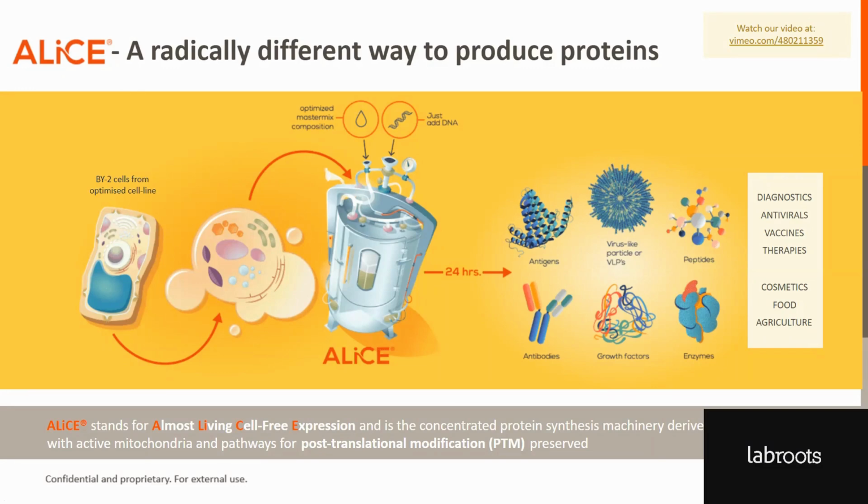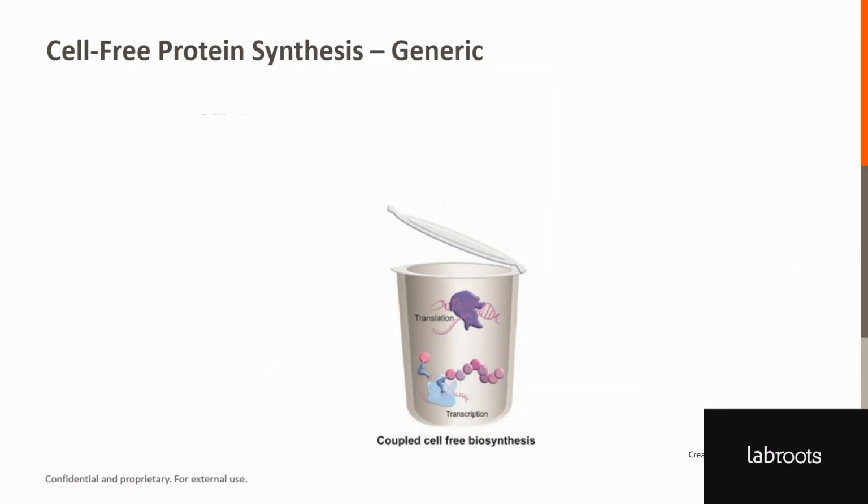On screen, you see some examples of antibodies and growth factors and enzymes. You can think of these as therapeutic candidates. But we've also produced numerous antigens and virus-like particles with more relevance towards vaccines or diagnostic purposes, and also some peptides. So to dive in a little bit further on what actually is cell-free protein synthesis in general.